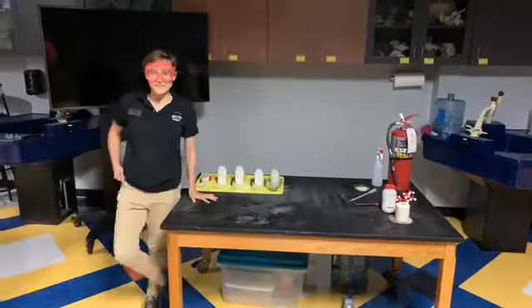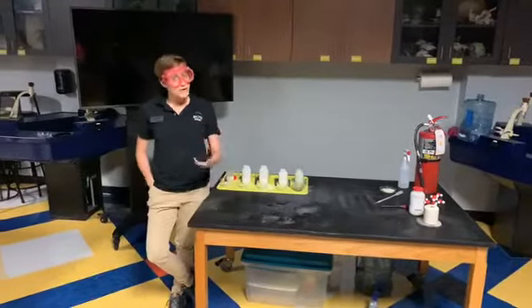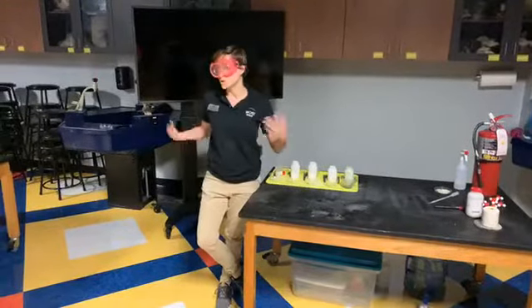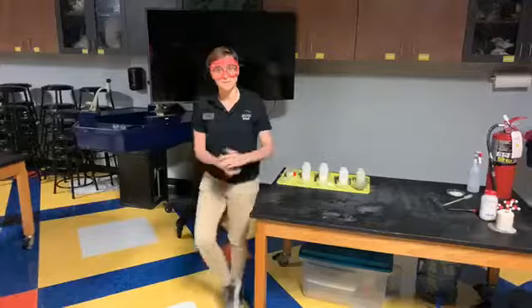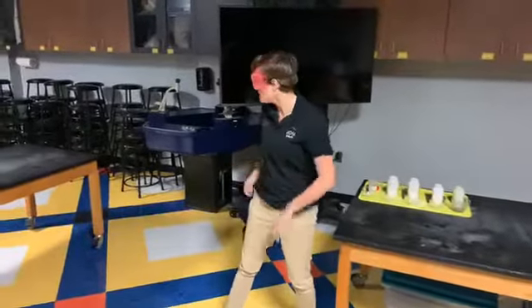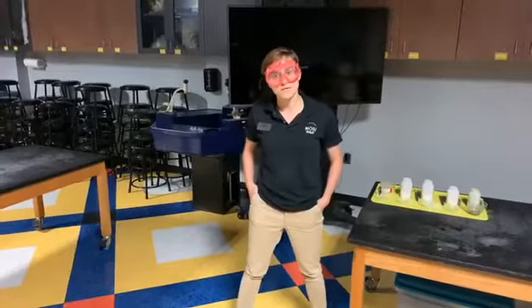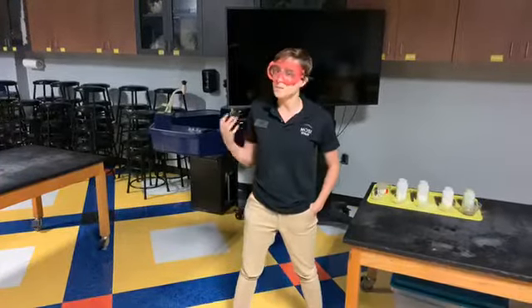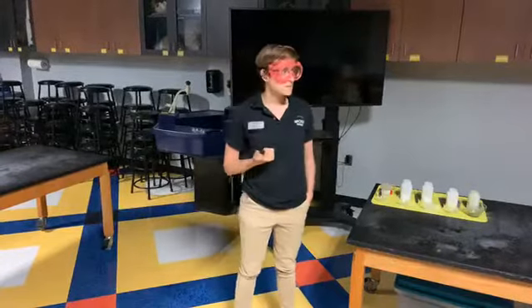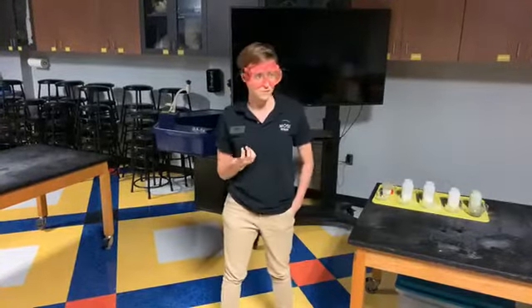All right. So I mentioned earlier that you shouldn't be doing this activity at home. This is something we've been trained to do. We have the proper safety equipment to do, and we're doing it here in our STEAM lab. Since it's Field Trip Friday, we thought we'd show you a little bit more about the lab that we have. This is where we do all of the activities and experiments that maybe are our most extreme, that we can't easily do in other places.